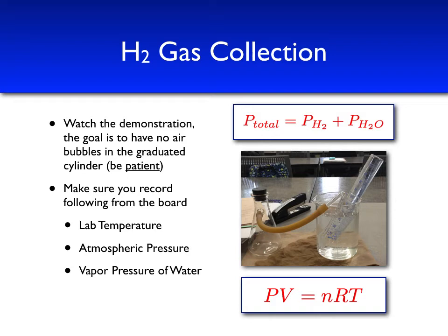Of course, the very important part of this is that we have to get the graduated cylinder completely filled with water and inverted into the beaker of water. Spoiler alert, this takes me 3 tries during the video. So it's usually important that we be pretty patient. It's important that I also show you that process to show that, just because you're a professor doesn't mean things always go easily.